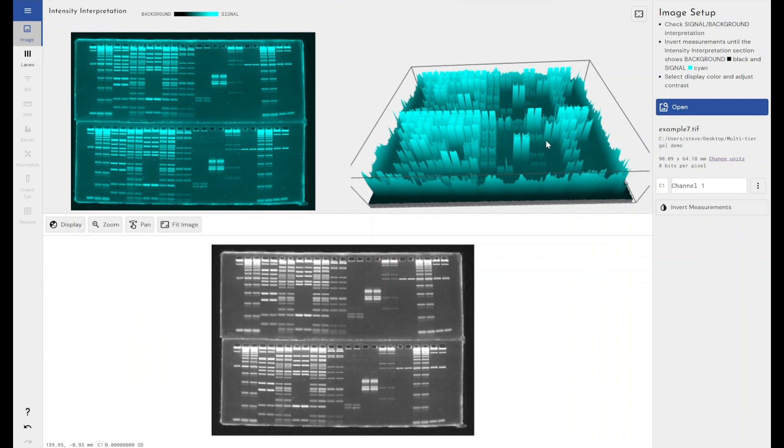It doesn't matter where you are in your analysis workflow. If you notice something that is particularly interesting that you want to add an annotation to, you can do that. That annotation goes into your report at the end. So when you export your results, in 10 years from now, if someone reads the PDF report of the experiment that you've done, all of your comments, your notes, your annotations, they'll still be there.